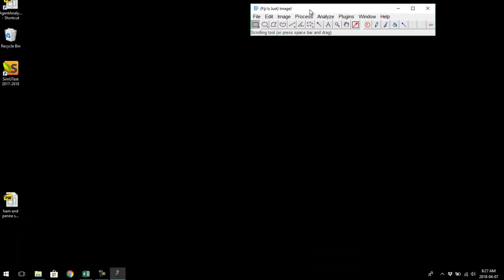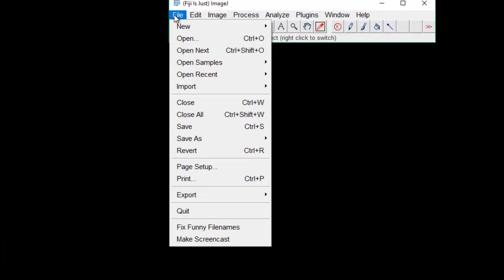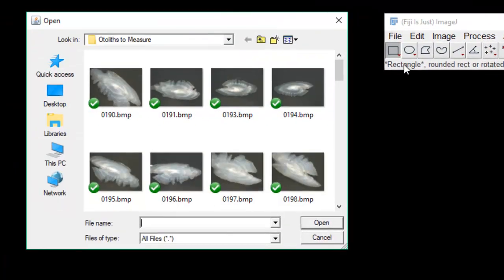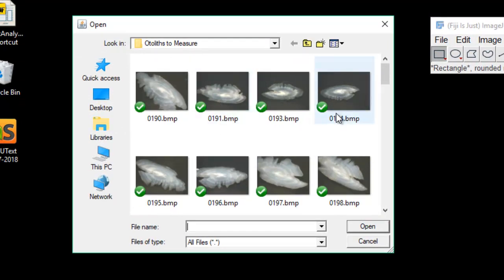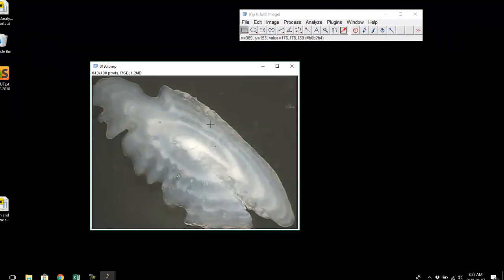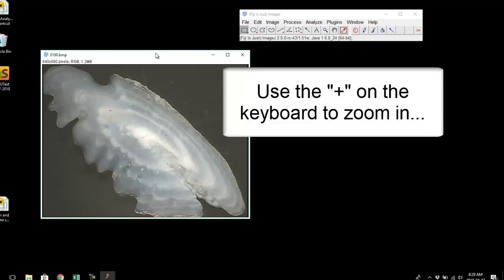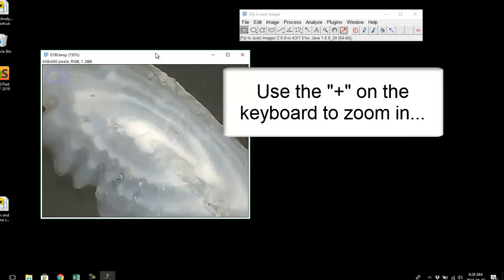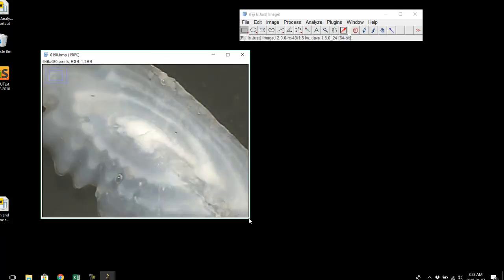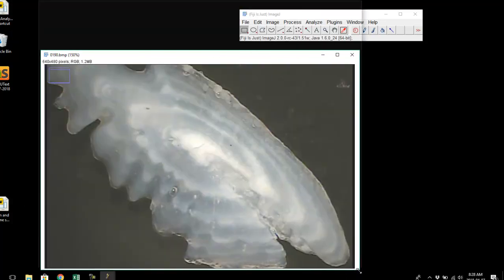Now the macro is ready to go and we need to load in an image of an otolith. I've got some sawguy otoliths here. I'll take the first one — you can see the otolith, the focus, and the annuli. I want it a bit bigger so I can more easily see where I'm marking. Hit the plus symbol on your keyboard to zoom in, and you can also drag the window to be a little bigger.